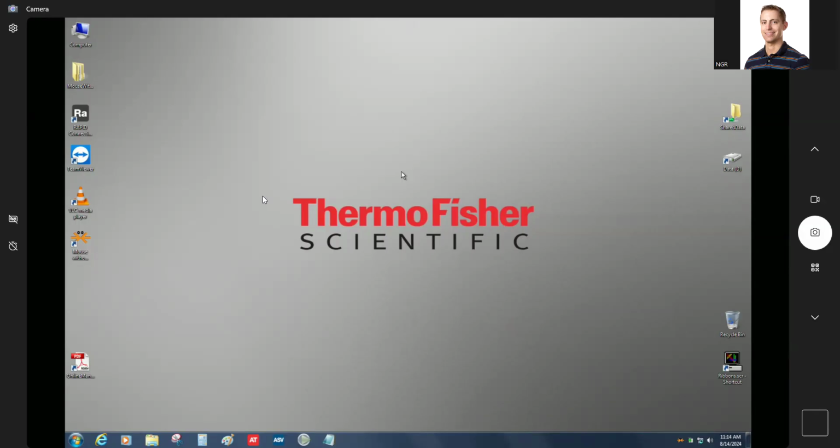And I'm going to give this a minute. The next thing we need to do is open up the server window. My experience with this is that if we tried to open the server window now, it's just going to hang for a little while. It'll boot up eventually, but I'm going to give this a minute or two before I actually do that.